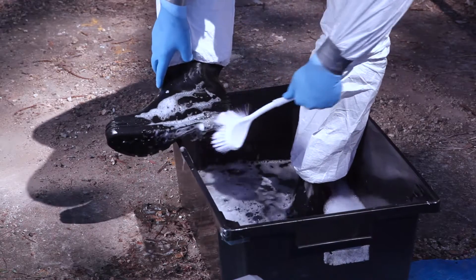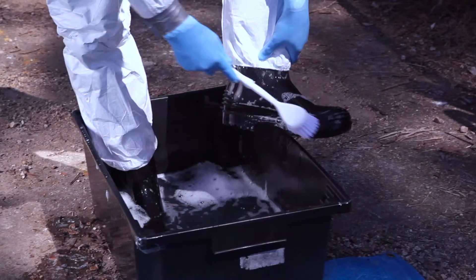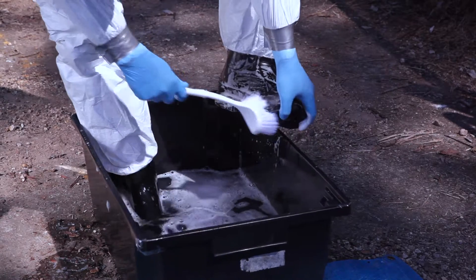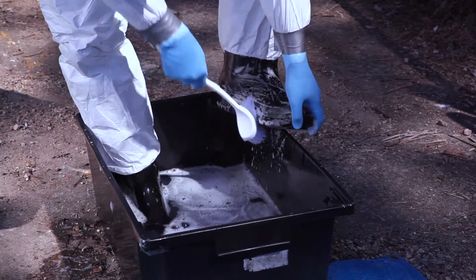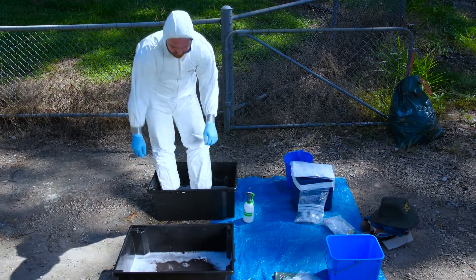Such material may have accumulated while moving from the gross cleaning site to the personal decontamination site. A hoof pick or screwdriver works well to get debris out. No visible organic material should remain following this process. Clean your cleaning equipment such as the brushes and hoof pick or screwdriver used to scrub your equipment and boots, and place them across to the disinfectant tub.